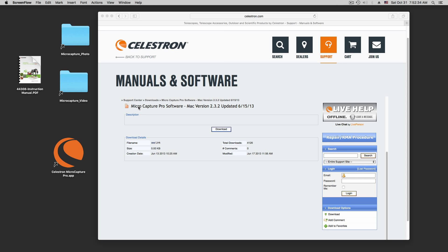I am on the Celestron website here. I have MicroCapturePro software, version 232. Last update in 2013.